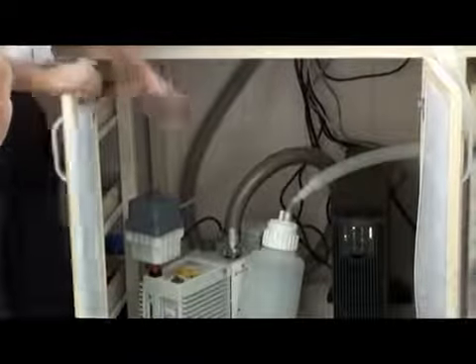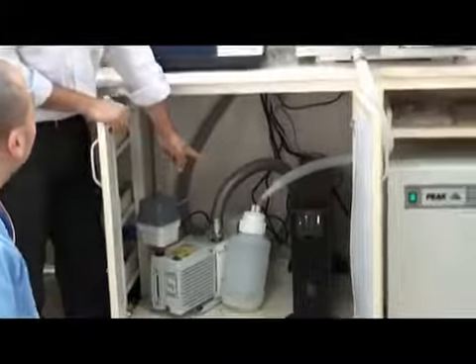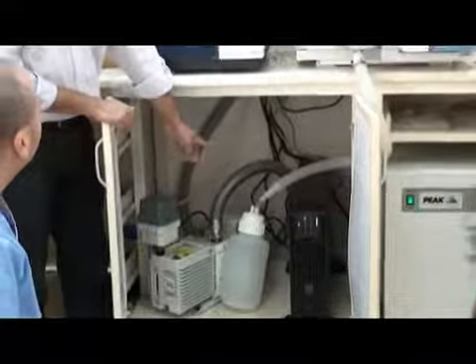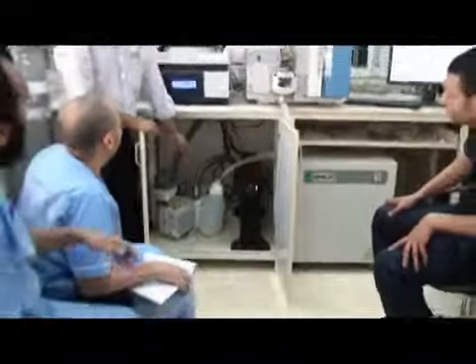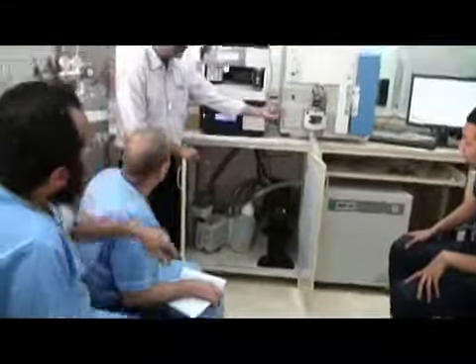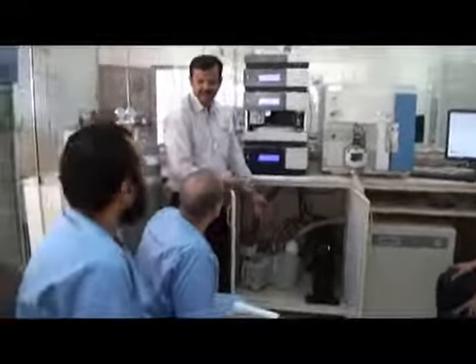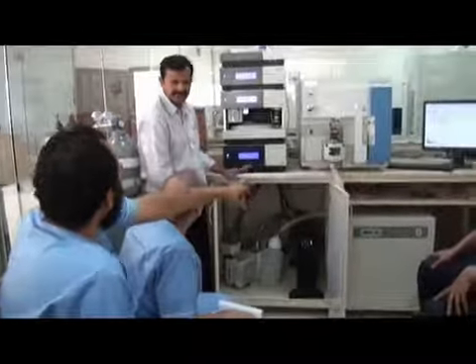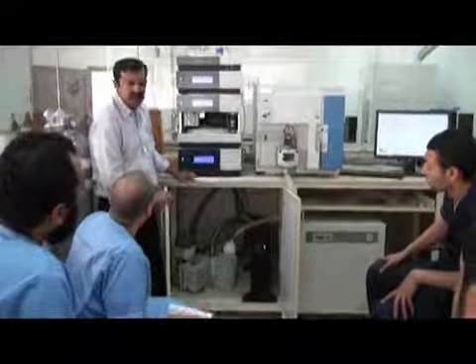And this will fall also? This will never be full, because a lot of gas is coming and it will evaporate. The flow is very small here. It will never be full, but just keep checking it. So the drain here is only for nitrogen, and for liquid also.